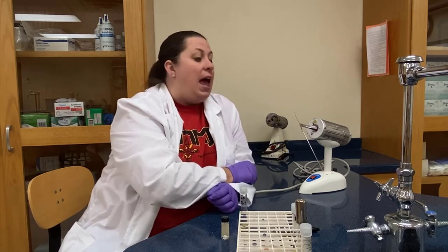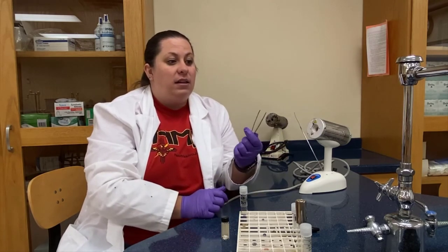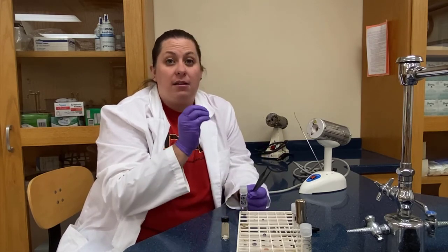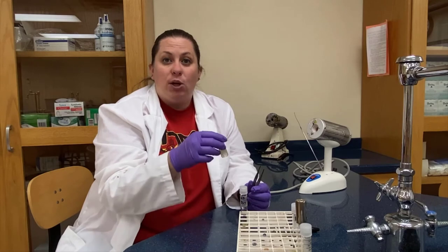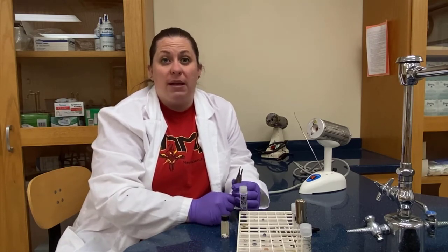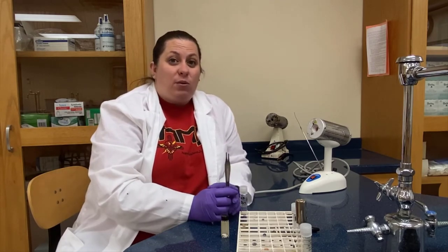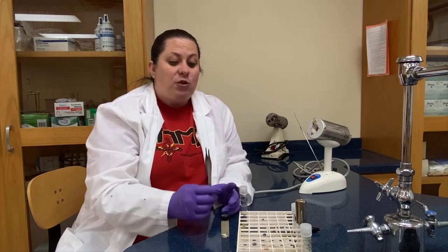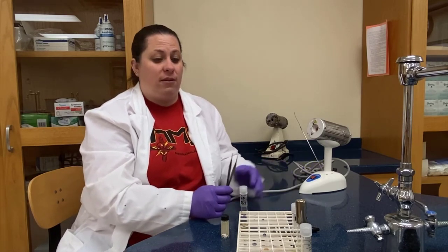We're going to wait until the forceps are red hot and then pull them out. These are going to take a little bit longer to cool because the metal is a lot thicker. Again, we don't want to use them when they're super hot because it could burn our discs or denature an antibiotic or disinfectant — the heat could cause that chemical to no longer be useful. So we let them cool: we're not going to lay them down, not going to blow on them, just hold them and let them cool. We'll re-sterilize them after we're done transferring the disc.